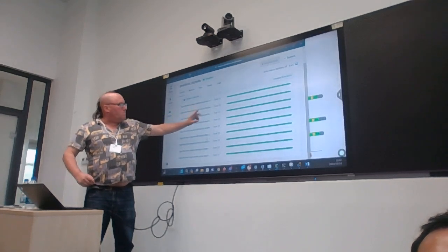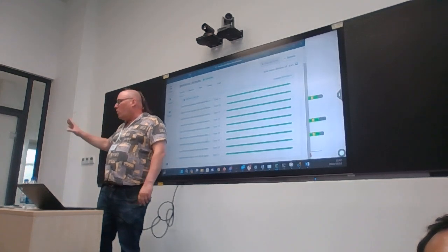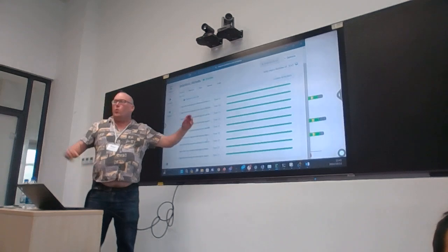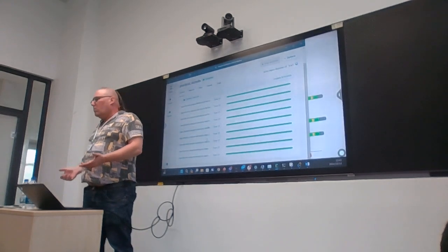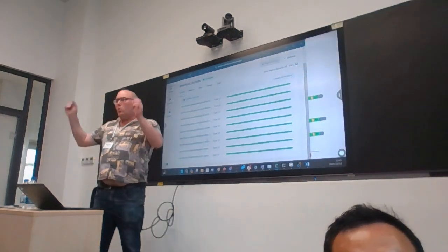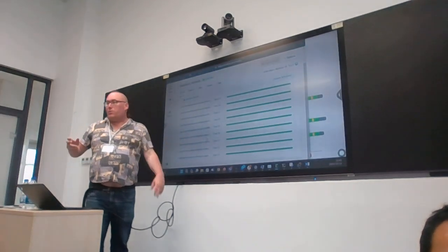But the first thing that it does is it removes any trace of human reads from the data. Okay, so it performs host filtering. The next thing that it does is it trims. It uses a tool called Trim Galore to remove sequencing adapters from the data in case any of those are left over when you've got your data at this point. Then it maps to the reference, and then it trims the primers, and then it computes the consensus sequence, okay?